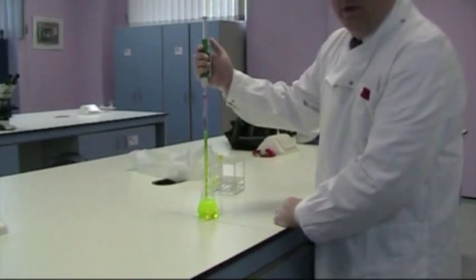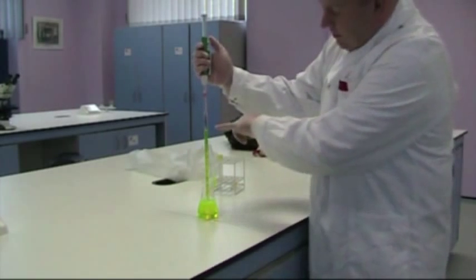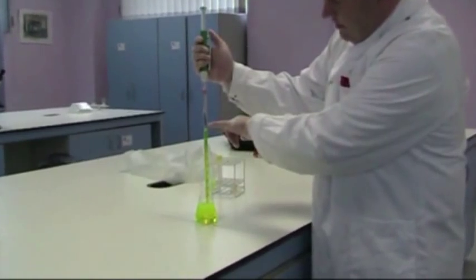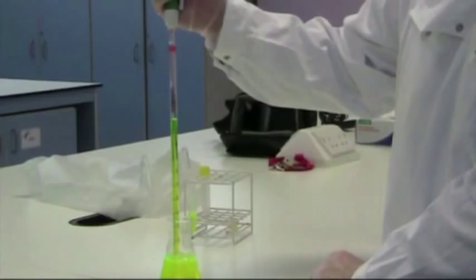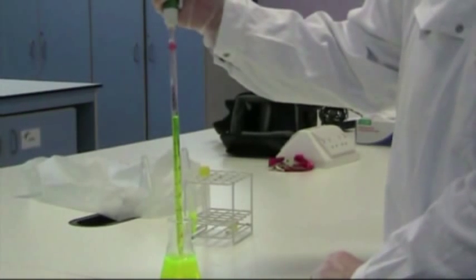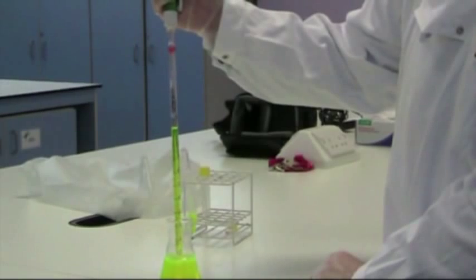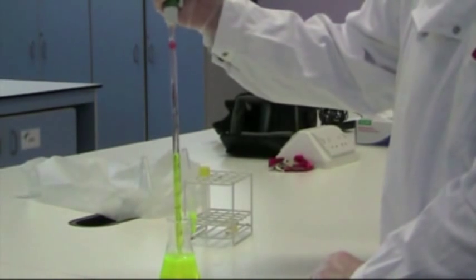This pipette is also ideal for making sequential dilutions. So we have this set to naught, and because this is a 10 mil pipette, we can therefore get 10 1 mil units from this pipette. And we do this by simply using the thumb rotor down to 1, and then we can take it down to 2, down to 3, and so on.